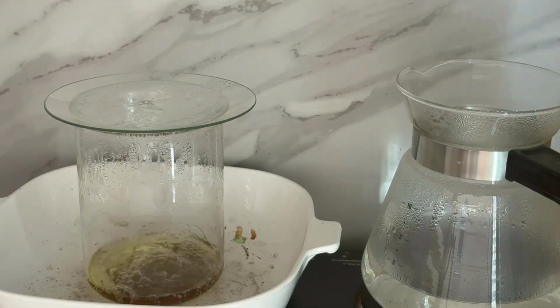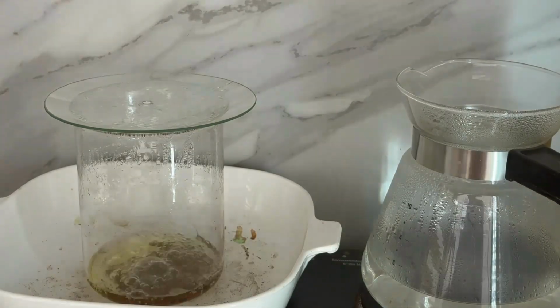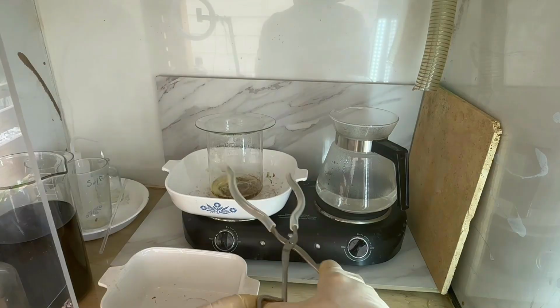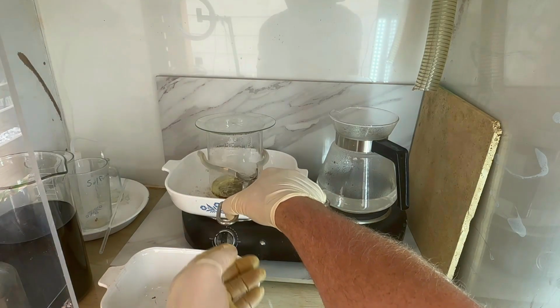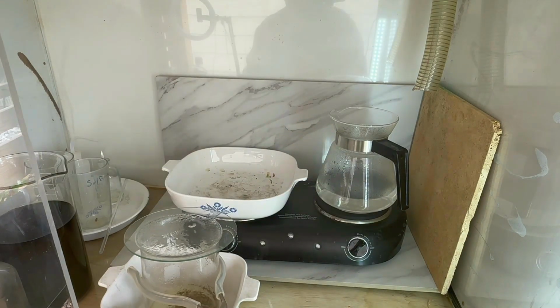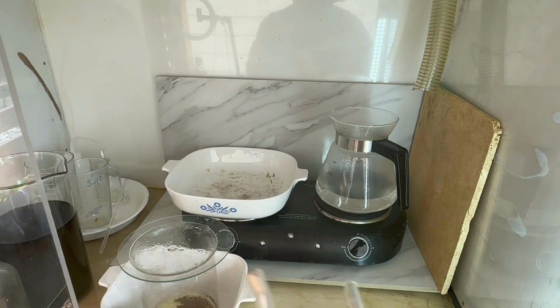So we're going to let that boil, pull as many of those out as we can. Then we're going to rinse that off. Next to it, I've got some boiling water. We're going to do a number of hot water washes to really clean as much of the contaminant metals out of this powder as we can. Okay, so we're going to pull our solution down, let the bubbling stop, and then we'll start our wash process.